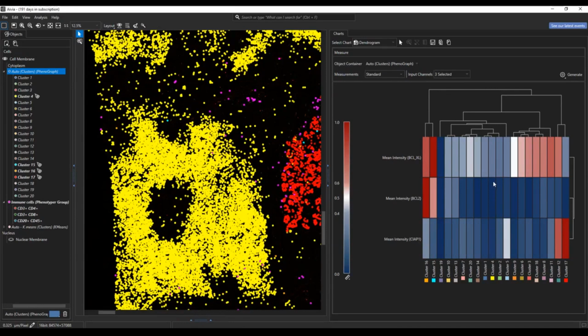Additionally, if we examine cluster 4, the one with the high expression of GLUT1, we see a relatively low expression of these anti-apoptotic markers. So from this image and our exploration, it seems that the cells directly within the hypoxic area are not surviving based on an expression or an overdrive of anti-apoptotic markers. They're likely utilizing a different mechanism to survive and grow within this environment.